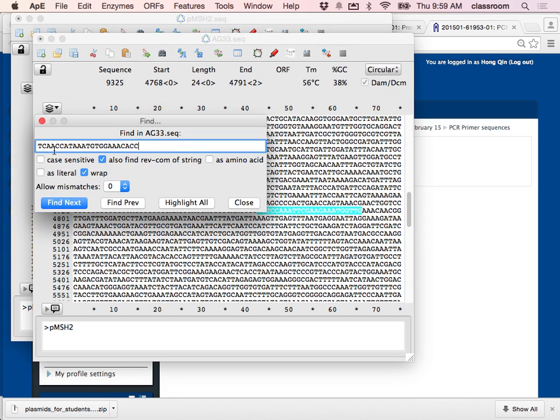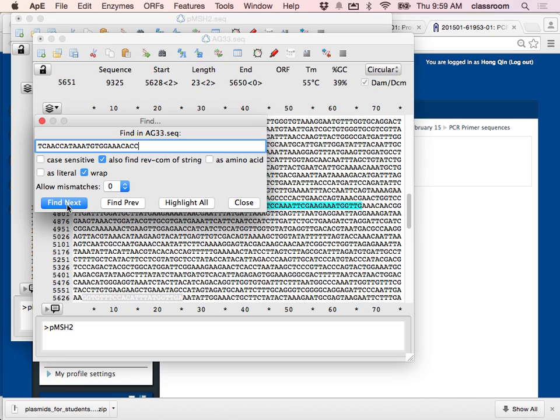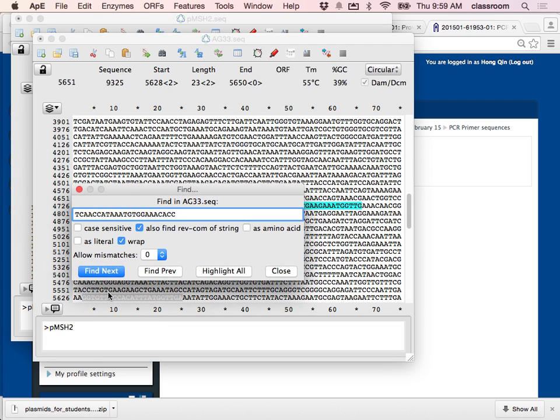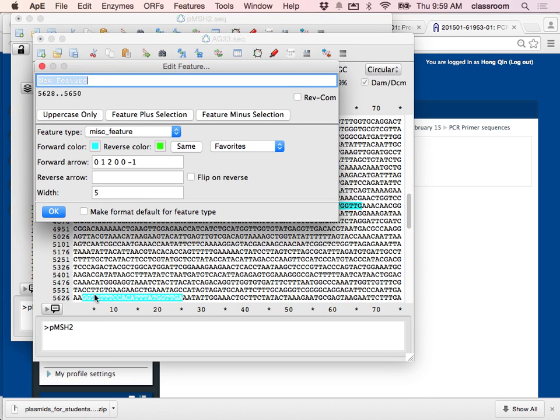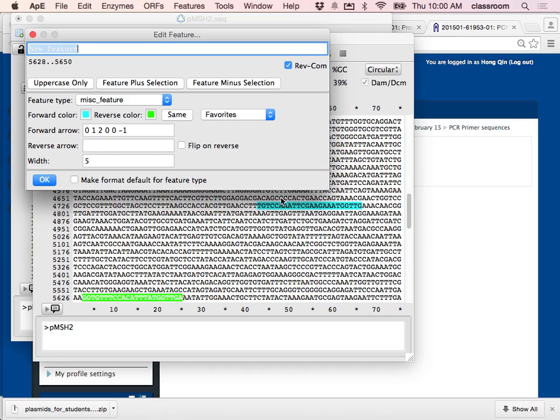Double-check TCAACCA — that's correct. I click Find Next and it found it. Looking at the bottom, that's the reverse complemented strand. The sequence starts with GGTGT — that's actually the reverse complemented strand for this primer. I close that window, go back to Features, New Feature, and this time I click the Rev-Com box for reverse complement. The color becomes green — the forward primer is shown in blue and the reverse primer is shown in green.